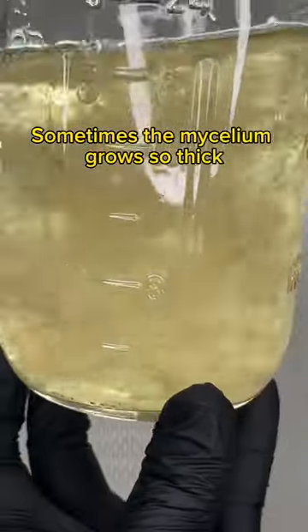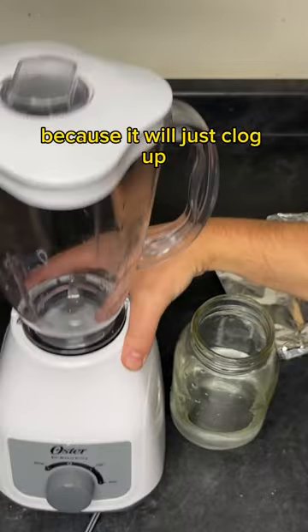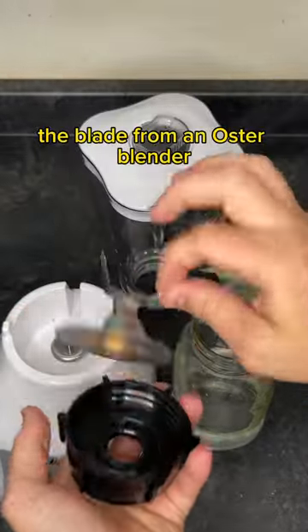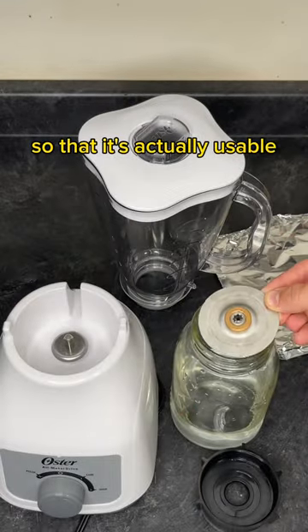Sometimes the mycelium grows so thick in a liquid culture that you can't make syringes with it because it will just clog up. In this video I'm going to show you how you can sterilize the blade from an Oster blender to chop up that mycelium so that it's actually usable.